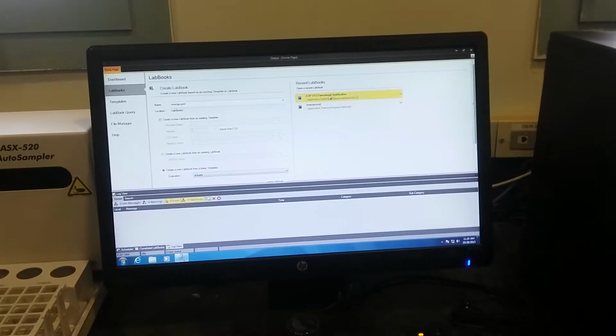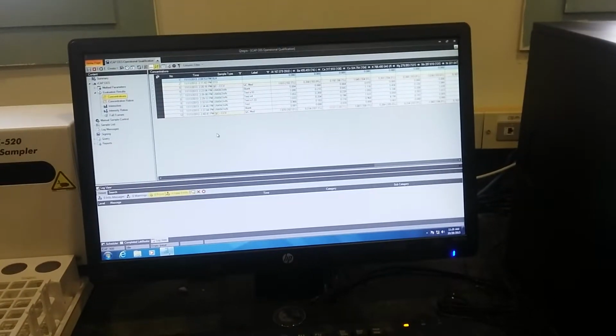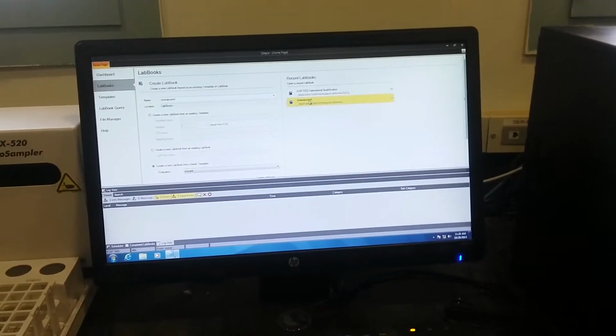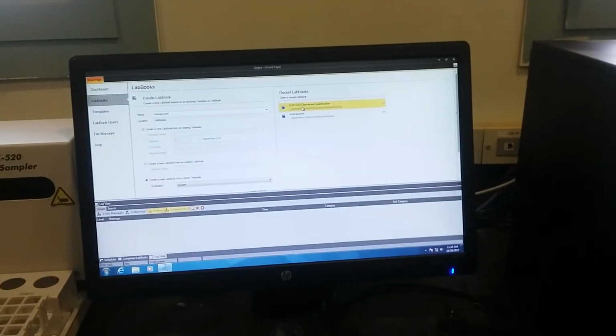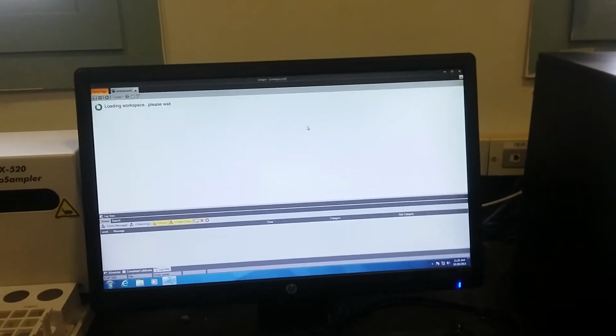So now we will not start it yet. What's the reason? No, this is different. Sorry. This one I opened is a previous test. This is the qualification in the factory. This is the one we made. Created method. This is the one.